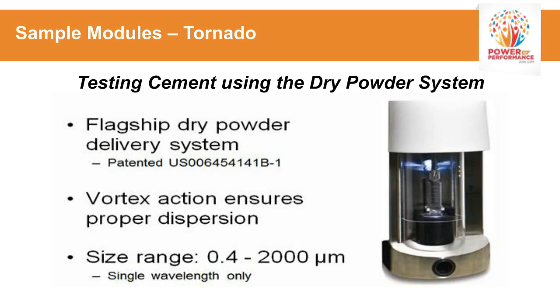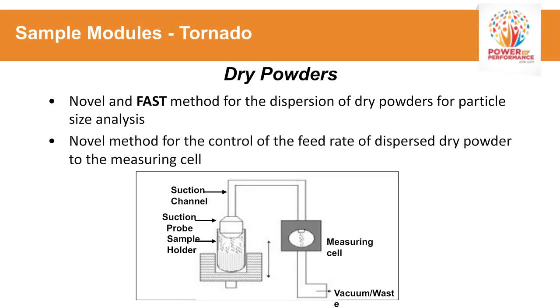In this design, we took into consideration the possible use of pressure and vacuum, and we worked out this unique system where it only requires a vacuum, like from a vacuum cleaner type device, and the computer controls the exact vacuum that you put on the system, but you typically are going to run with about 12 inches of water vacuum for most applications.